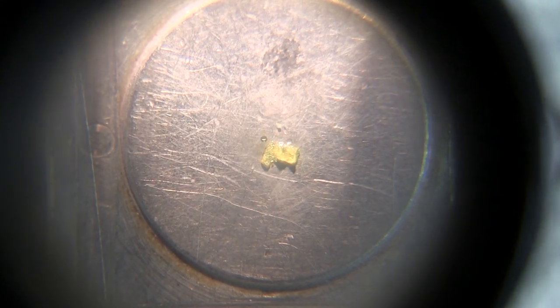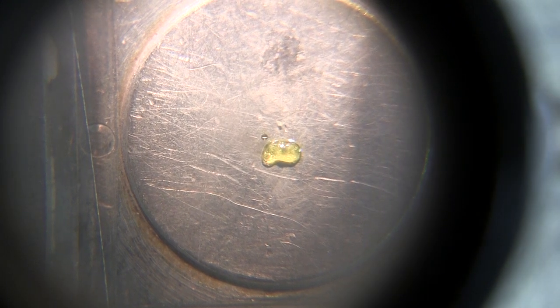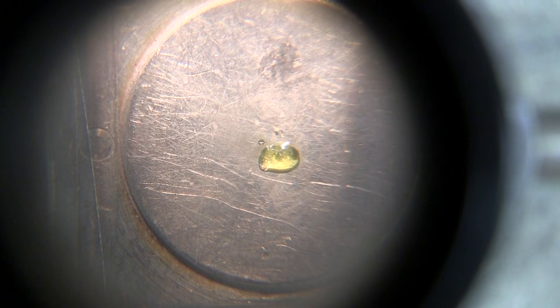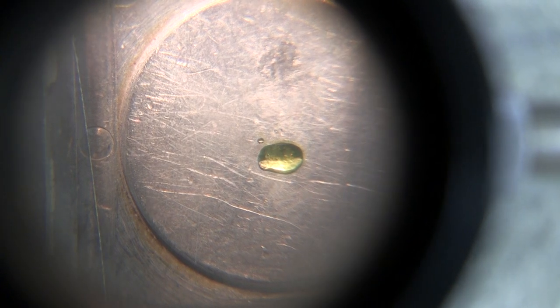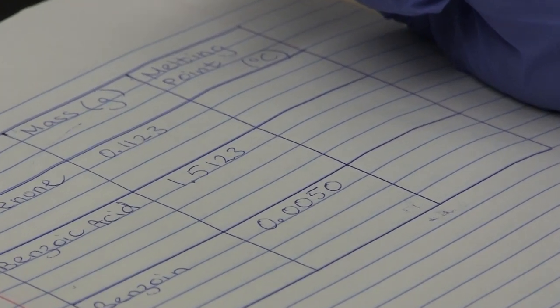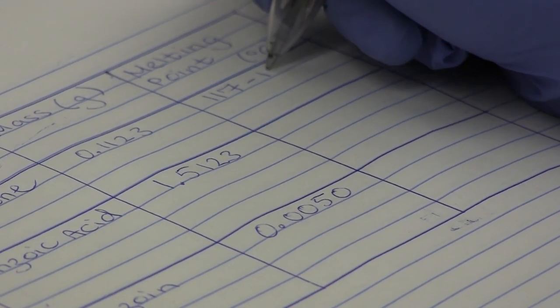When the crystals begin to melt, in other words, turn from solid to liquid, the temperature is noted. Heating is continued until the very last crystal disappears, in other words, until the sample completes melting. The temperature is noted again. And in this way, we almost always report a melting range.